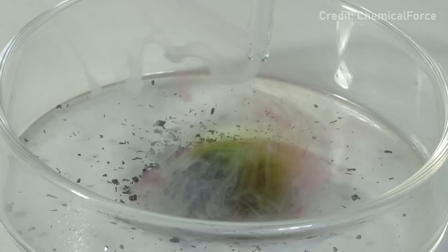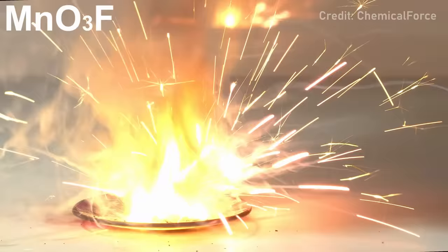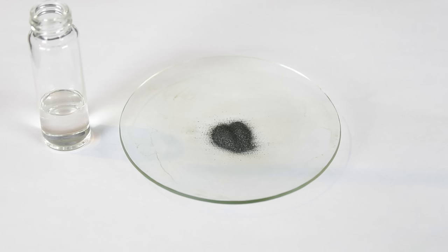This next reaction was inspired by another chemistry YouTuber named Chemical Force, who made something called permanganyl fluoride by mixing fluorosulfonic acid with potassium permanganate. His demo was pretty awesome, but it made me wonder: what happens when you mix chlorosulfonic acid with permanganate? Well, let's find out.